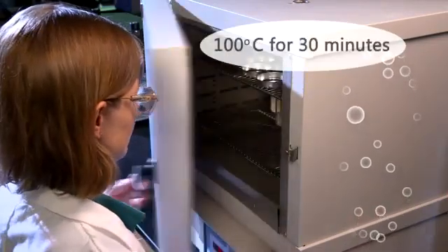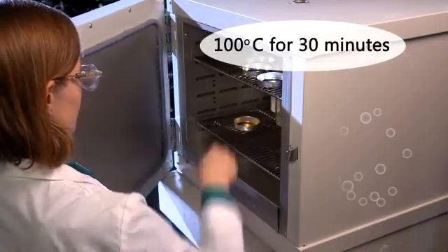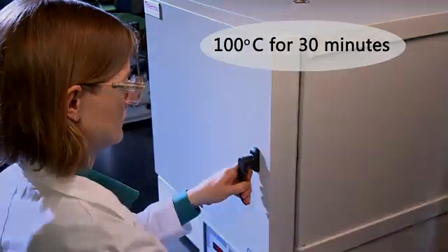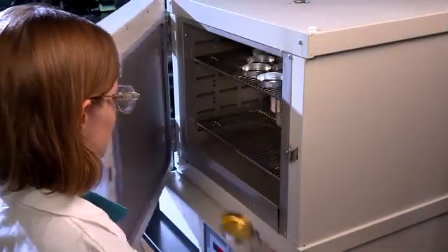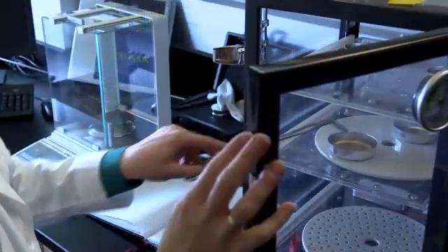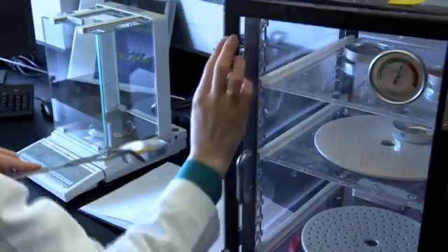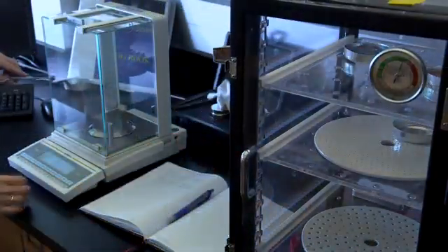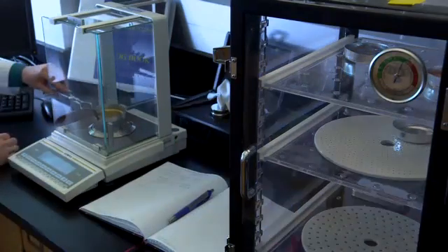Once dry, place the dish in an oven at 100 degrees Celsius for 30 minutes. Next, remove the pan from the oven and place in a desiccator to cool to room temperature. Once cool, place on the balance and weigh.